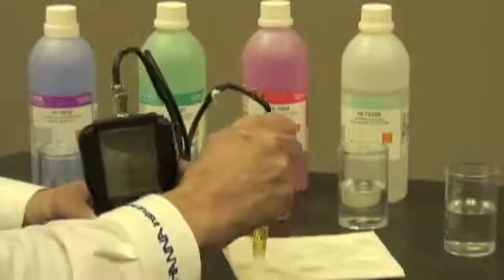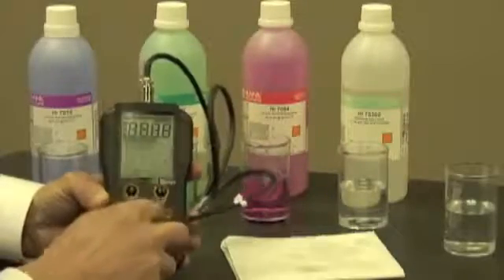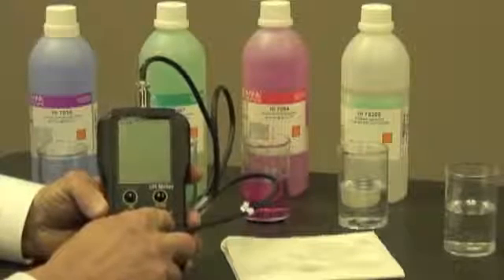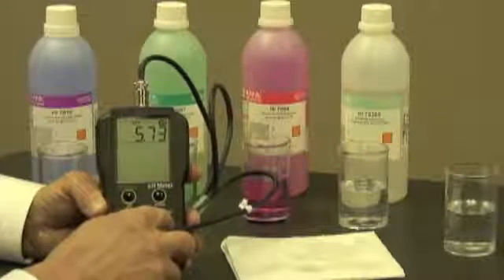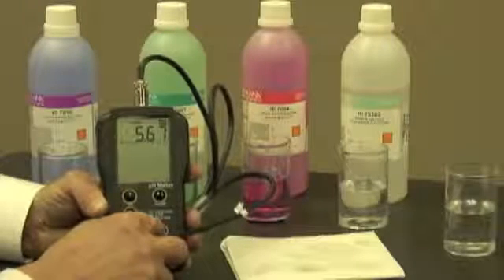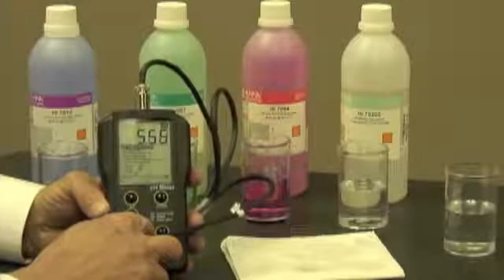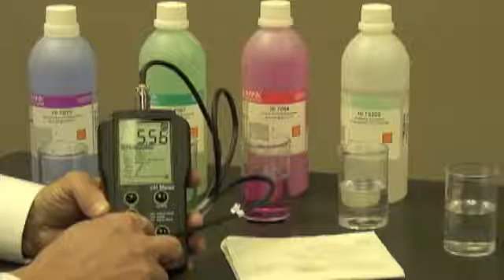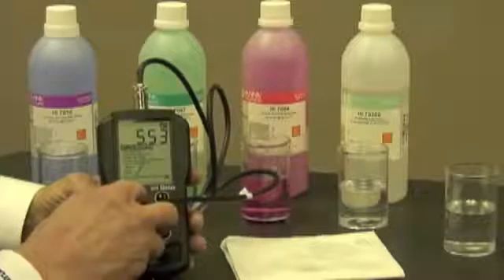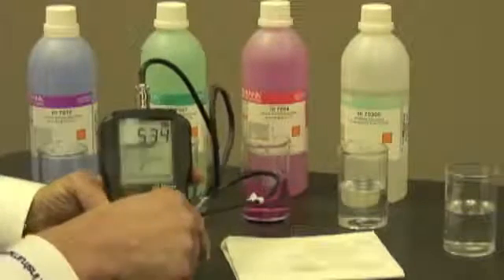Now I'm ready to calibrate. I'm going to turn my meter on and let it go into its startup measurement mode. Then I'll hit the calibration button and follow the on-screen instructions to do the calibration.